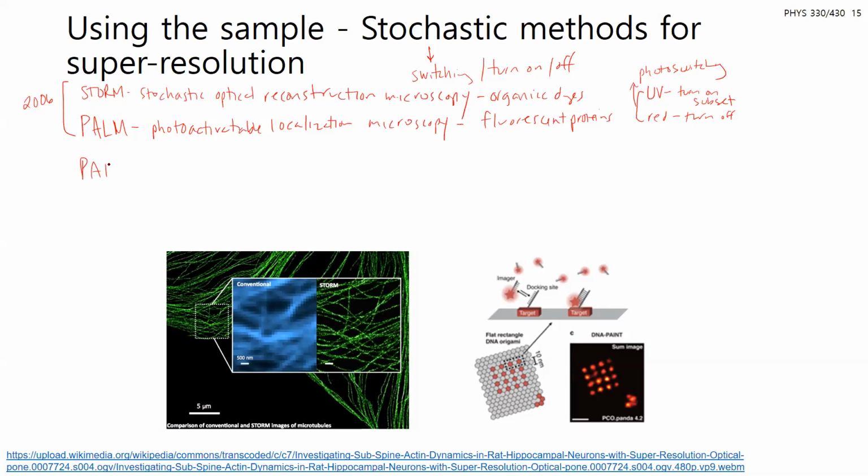Another technique is PAINT, which is points accumulation for imaging nanoscale topography.